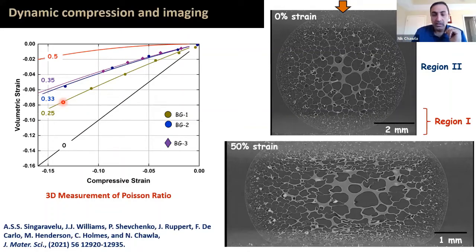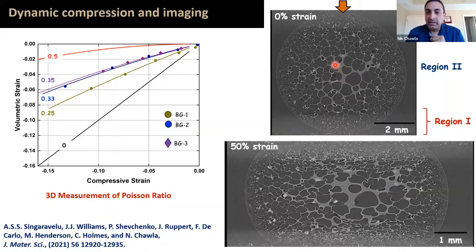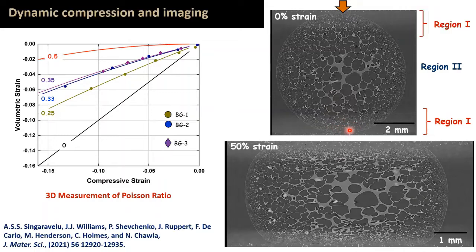So a quick question, Nick. Can I ask a quick question? Yeah, sure. So is there porosity here? I mean, what exactly is shown here? I don't quite understand. Yeah, so you can see my pointer here. These are all the pores. These are all the hollow cells. Okay. And the lighter gray is the polymer, and they're essentially the ligaments. I see. So you cannot see so much on the outside because the pores are a lot smaller. I see. Getting close to the resolution of the technique.